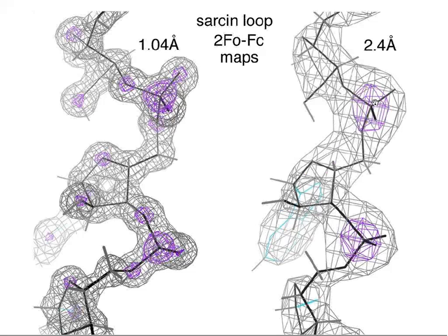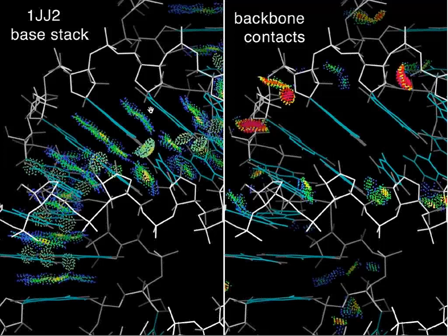You just see a tube and you can't see the ribose pucker and you can't see which way the atoms zigzag. And so the result of this is that at usual resolutions, the bases look gorgeous. They have wonderful stacking shown by these blue and green van der Waals dots, and excellent base paired hydrogen bonds shown by the little pale green pillows of H-bond dots. But if you look at the backbone, it has a lot of problems.